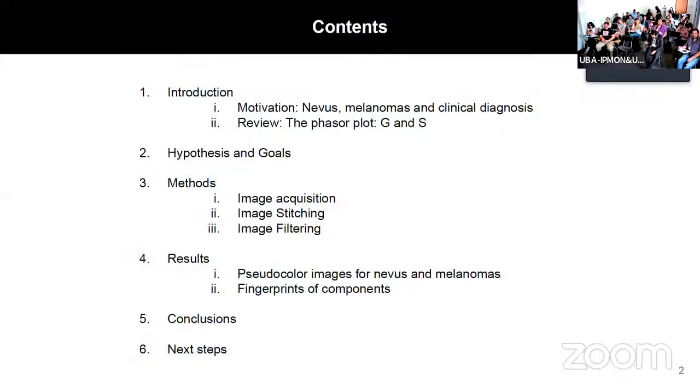So what we are going to cover here is the phasor analysis, that I know a lot. Then I will present the hypothesis and goals, the methods, which include how we image in the microscope, image stitching and filtering. Then I'm going to pass through the results and finally the conclusions and what we are going to do next in the next step of this project.